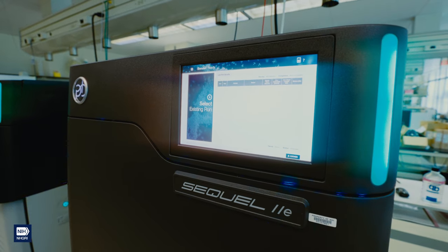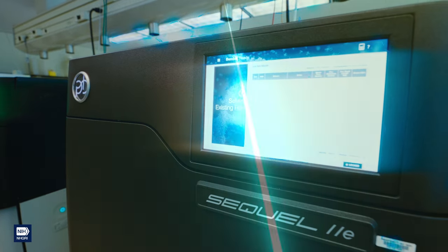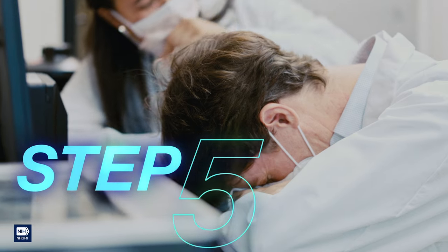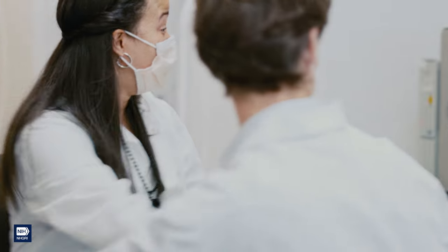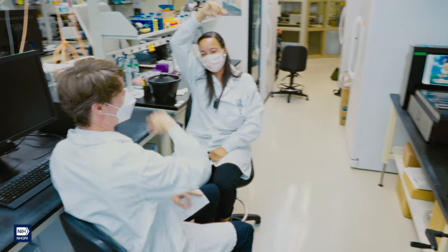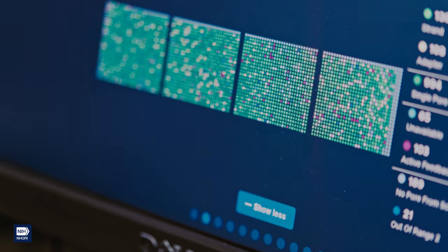This one may look like a refrigerator, but uses lasers and cameras to make a movie of the DNA being copied. Now we wait for all the data to be generated. While you are waiting, you can admire the colorful display that shows which of the nanopores are actively sequencing. Amazingly, you can watch the sequencing happen in real time. This step can take a few days.